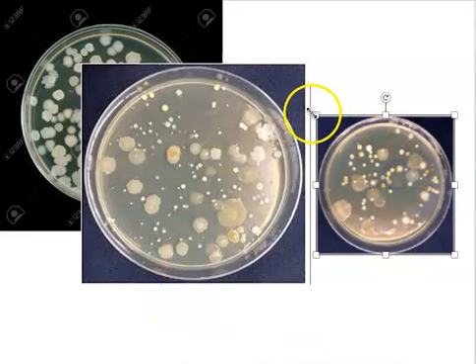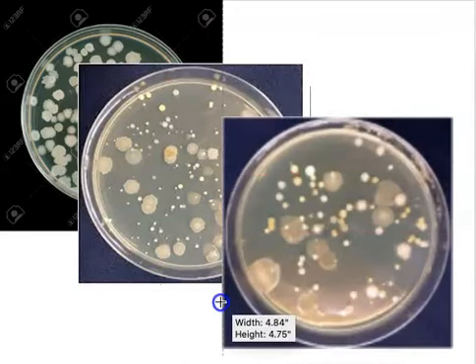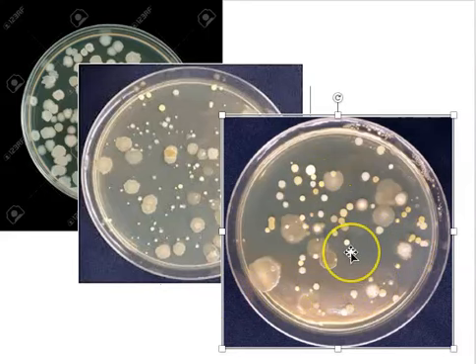Over here we have yet another plate with multiple species growing on it. If you see two colonies that have different colony morphology, you know that you're looking at two different species. So for example, this larger type of colony is a different species than this smaller white colony.